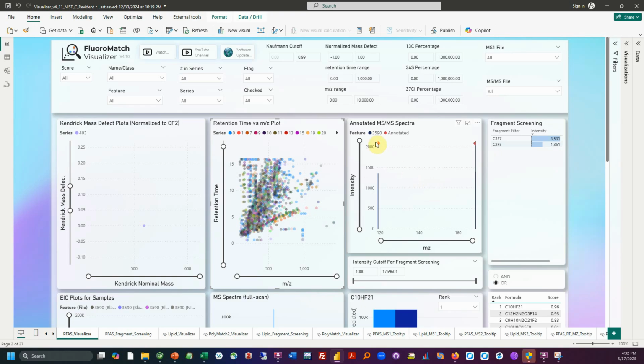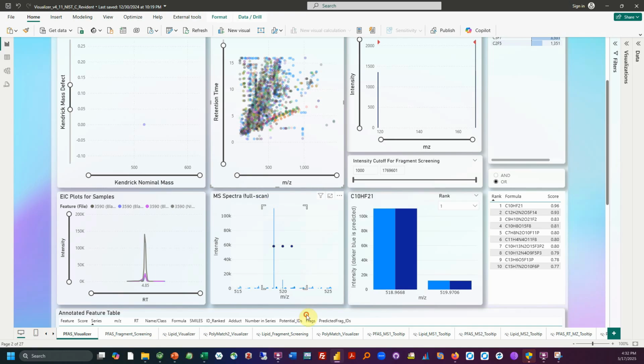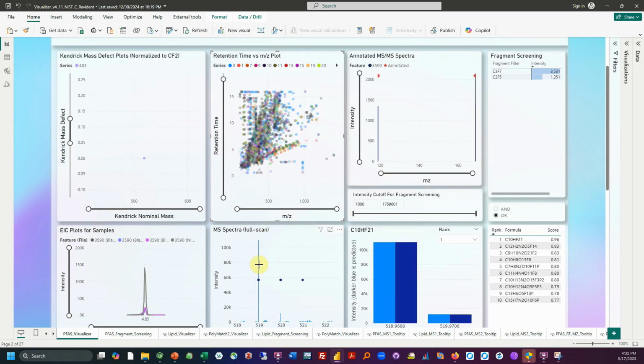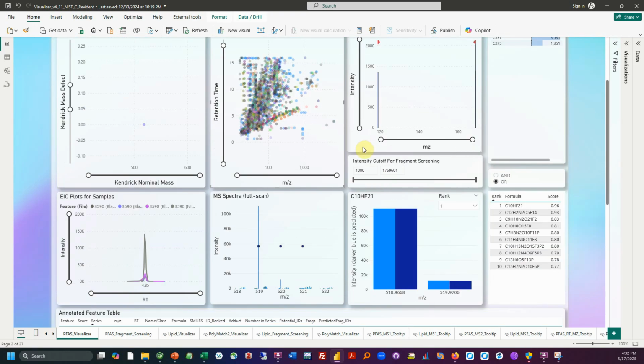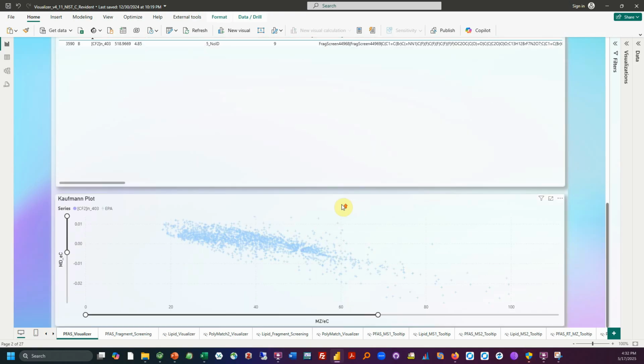And you can see here that it has a nice C3F7, a C2F5, and that its MS1 spectra is quite clean. You know, there's a little overlap, but you're really looking for things that are very big because they contribute a lot to the fragments. Since we only have 2 major fragments and we only have 1 major MS1 peak, then that relates to our molecule of interest, and this is likely a PFAS. And so that's how you can use fragment screening. You can also now look at formula prediction and figure out that it was an in-source fragment, M minus CO2, of a C10 PFCA. But we'll look into that later as well.